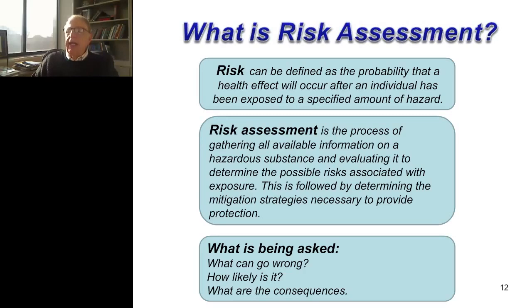And again, asking questions like, what can go wrong? How likely is it? What are the consequences? And I think the how likely is it is a very important question, because we can't always guard against every single risk that could occur. We have to guard against what's reasonable to expect to occur.